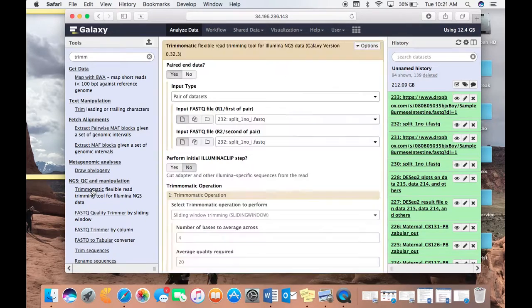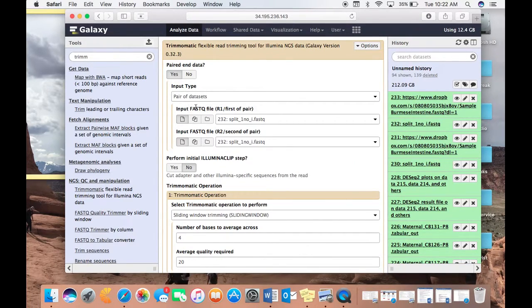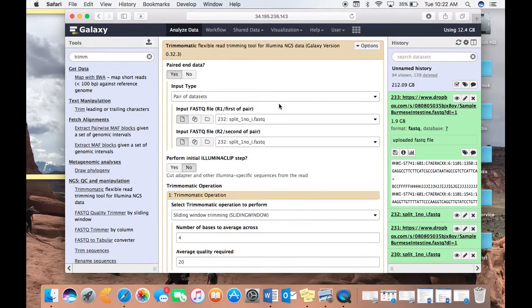And there it is. This window is going to appear, and the rest of this tutorial is mainly going to be parameter selection, but you can see the file that we just changed to FastQ Sanger appears here. It says input FastQ. What it actually means here is input FastQ Sanger. The file above is actually a FastQ file, but as you can see, it's not appearing in the drop-down menu, and that in Galaxy Tools is a good indicator that your data is not formatted correctly.